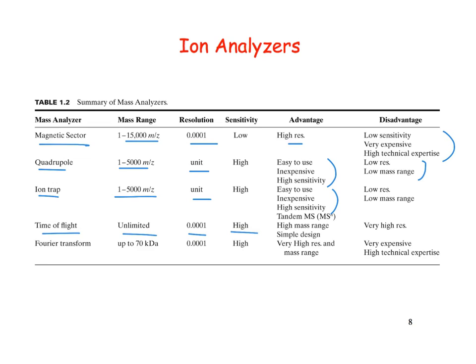But on magnetic sector, we can get a high resolution. Yes. Usually it's that double sector one for high resolution, though. Oh, okay. Yeah. But those instruments, they take up a couple of tables here, too. They're quite big.